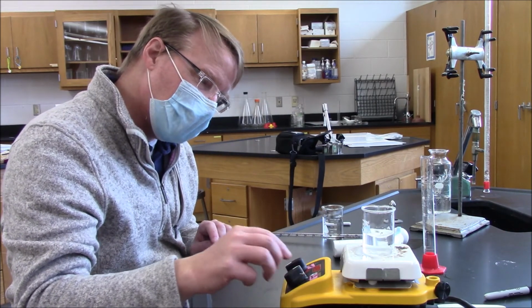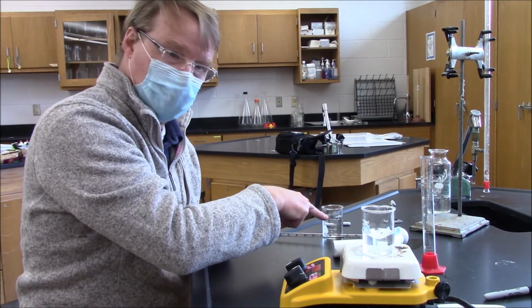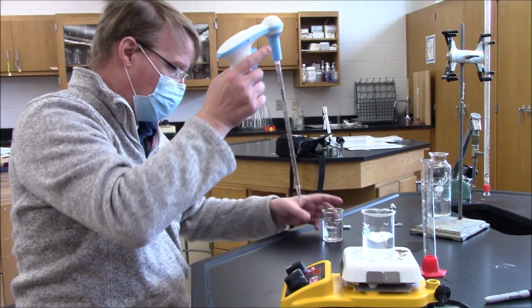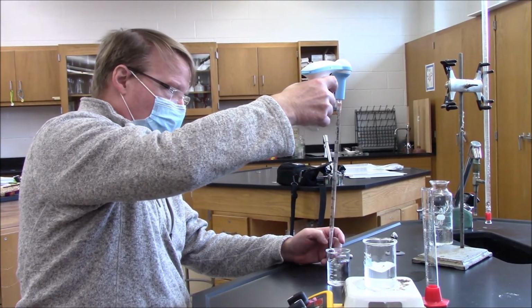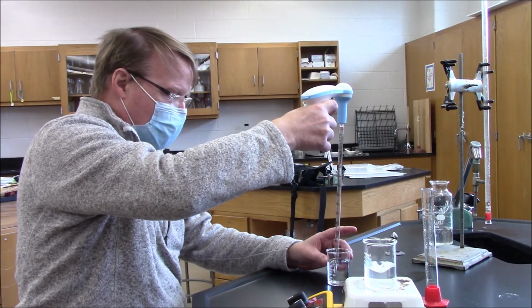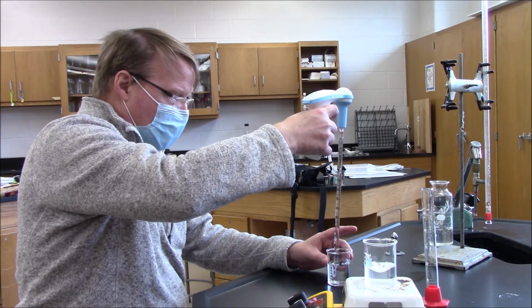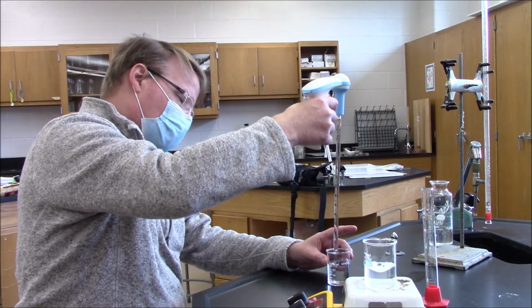There we go. Okay. All right, so now you're going to take your pipetter, and you're going to take 10 milliliters of the liquid in the beaker next to it. The top sucks it up and the bottom puts it in. So how much am I taking? 10. Yep, 10. So up to the 0, right? Yep. Good job. A little bit over. Is that okay? Yep.